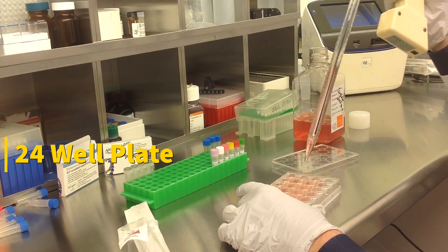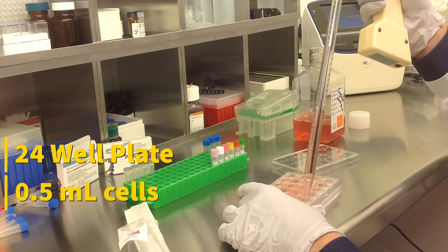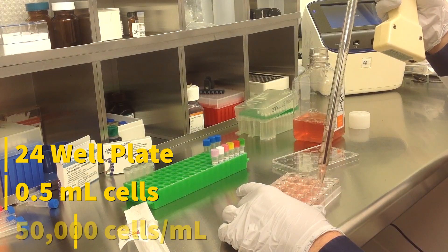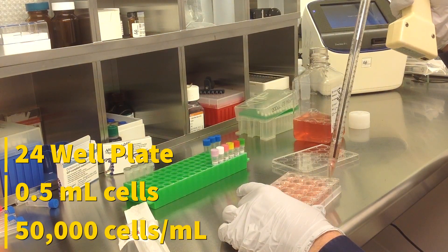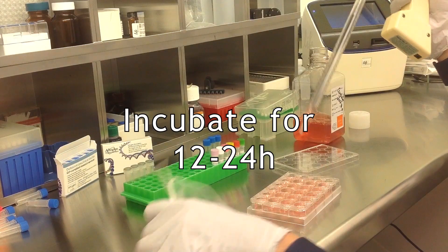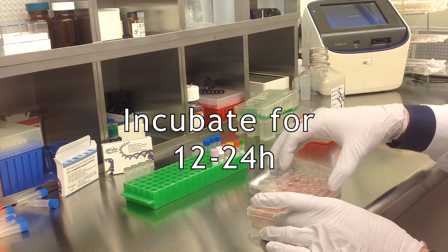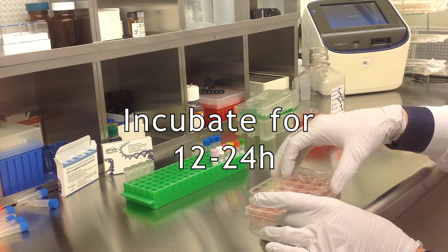Start by seeding 500 microliters of cells in a complete growth medium into the wells. Cell density should be at 50,000 cells per milliliter. Incubate the cells for 12-24 hours before transfection at 37 degrees Celsius in a humidified carbon dioxide incubator.